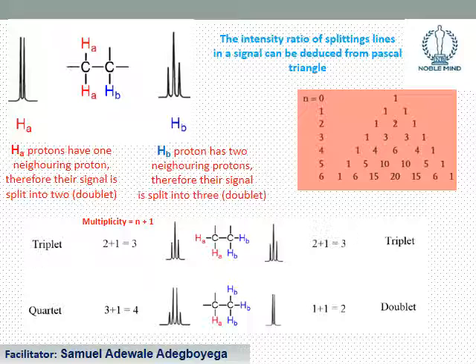The third peak carries the same, that is 1 3 3, and the fourth peak is also 3 times smaller than the middle peaks.